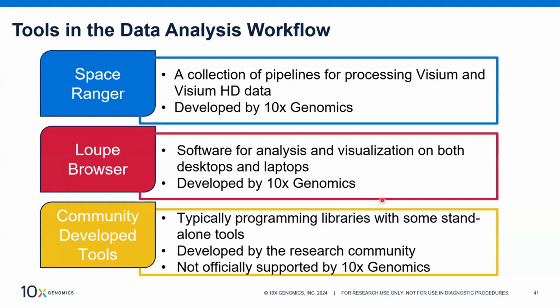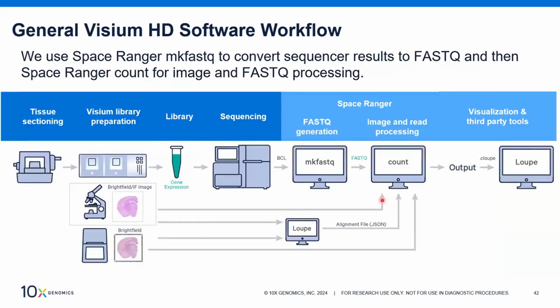And of course, we have a lot of community developed tools. These are not officially supported by us. They are developed by the research community, and they are typically programming libraries with some standalone tools that are directed at a certain type of data and a certain type of question. There are a lot of these tools, and I'm saying we do not officially support them, which is true, but we do have some recommendations for you on our website. So if you are looking into reaching out to data analysis by yourself, we do have some recommendations for you.